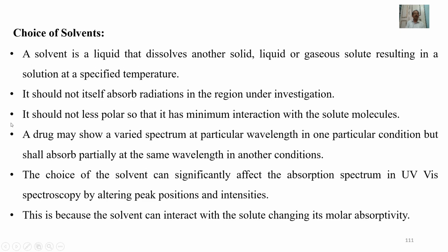Choice of solvents. A solvent is a liquid that dissolves another solid, liquid or gaseous solute, resulting in a solution at a specified temperature. It should not itself absorb radiations in the region under investigation. It should be less polar so that it has minimum interaction with the solute molecules.